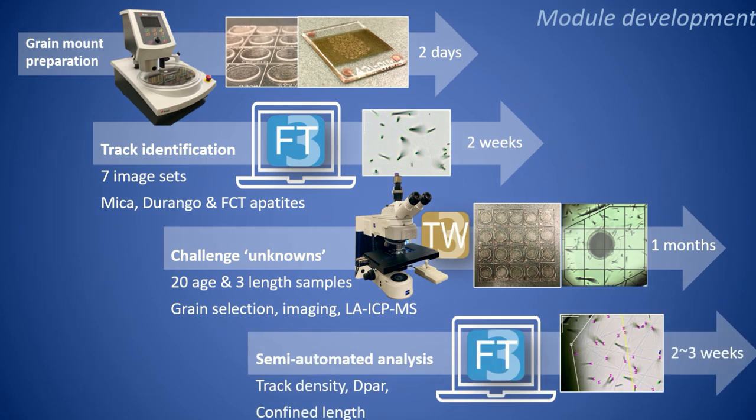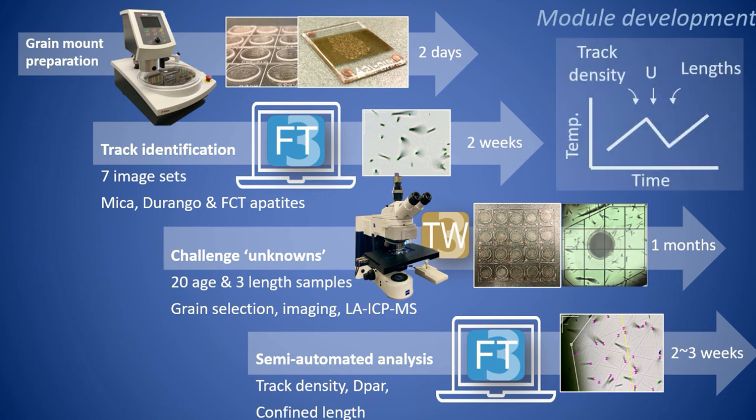Semi-automatic image analysis of images captured is carried out along with previous practice to produce essential data for age calculation and thermal modeling. Throughout the course, data obtained from each stage and their reproducibility against results from more senior analysts is constantly reviewed. Trainees are asked to complete all steps before they can start processing their own samples. It is undeniable that lab-based training experience is irreplaceable, but as in the unprecedented 2020 situation, visiting other labs may not be easy due to various restrictions.